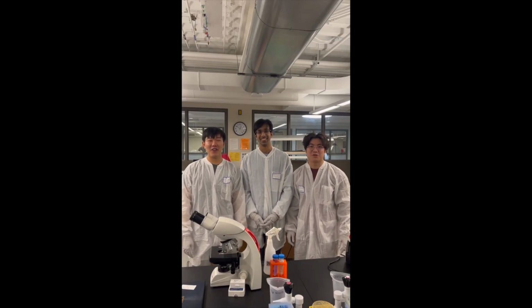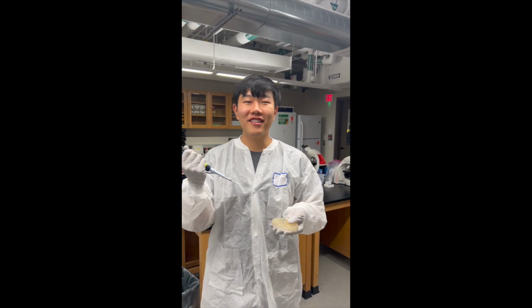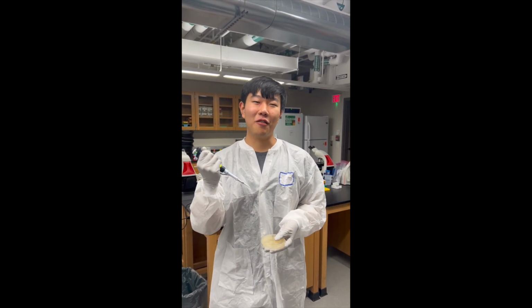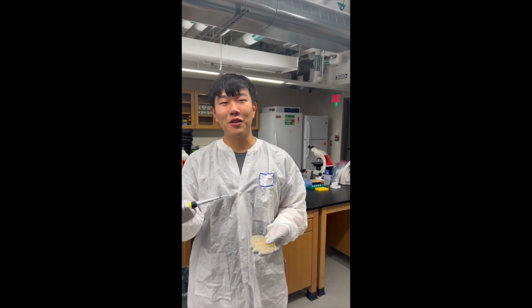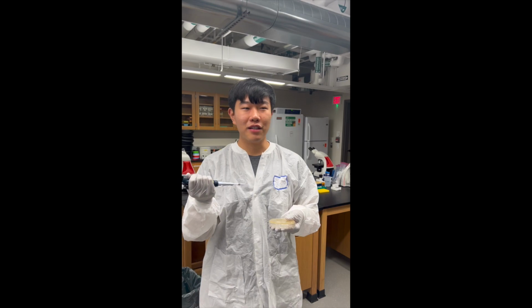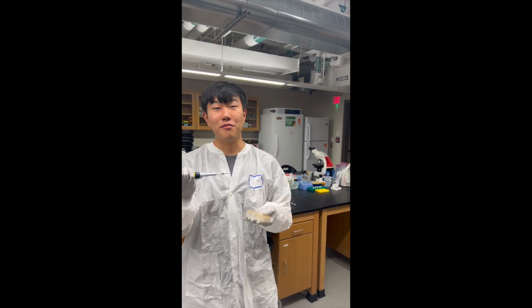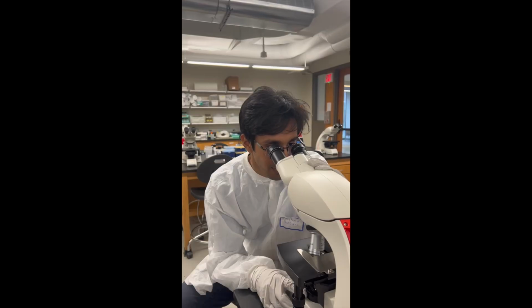Today we're going to show you how to conduct a mutagenesis experiment. Mutagenesis is the inducing of mutations in an organism's DNA to observe the resulting mutant phenotype. This is important for determining gene function in a biological pathway, since a mutation for a specific gene can interfere with the pathway and its products, so we can determine which genes are essential for such pathways.